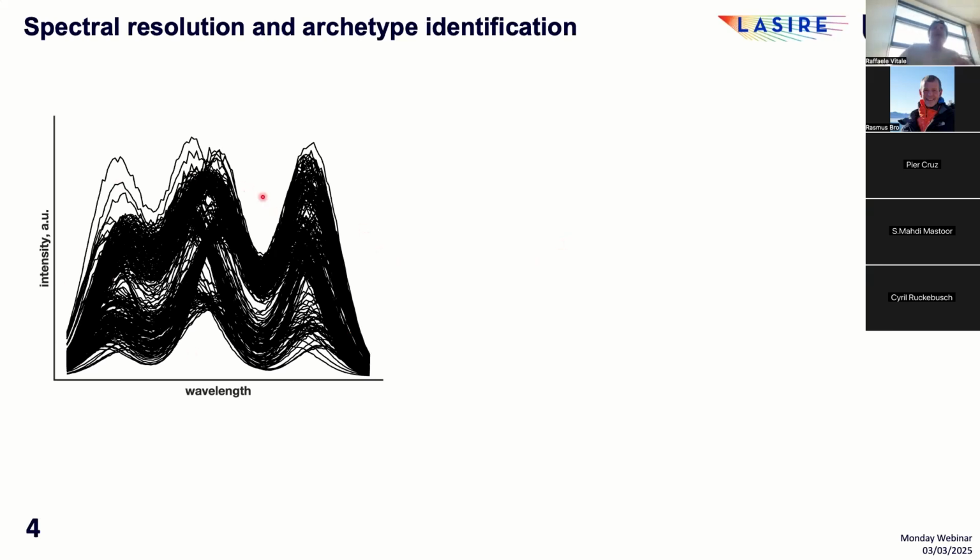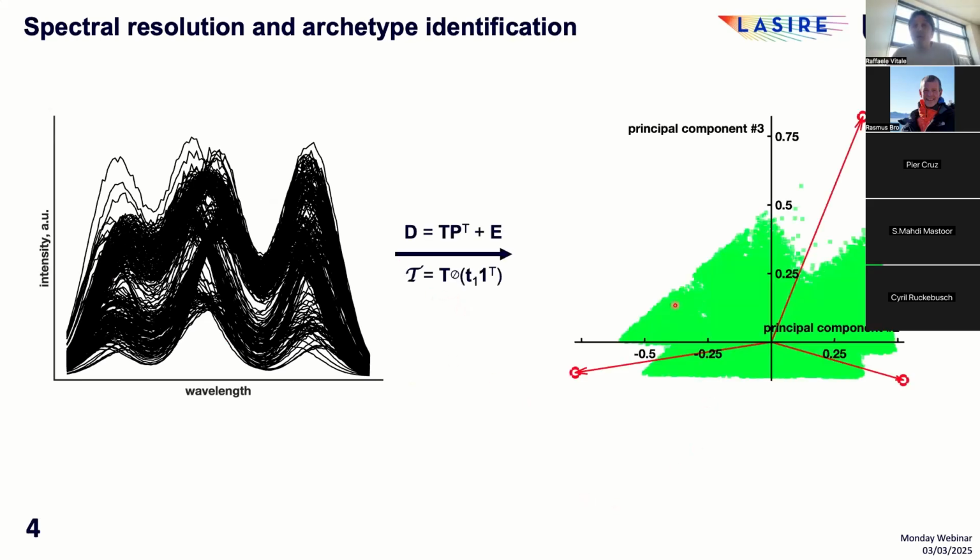That is to say that all registered spectral profiles are normally underlain by linear combinations of the aforementioned pure signal contributions. And this would correspond to a situation like this, in which a partial or incomplete simplex geometry is observed across the subspace of the normalized PCA scores yielded by the data decomposition.